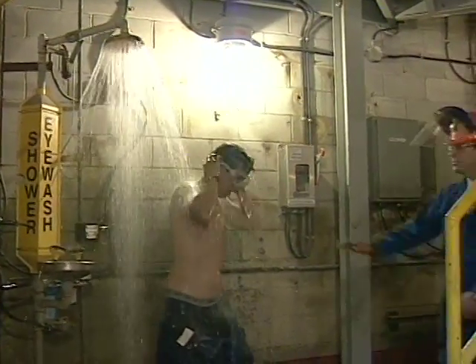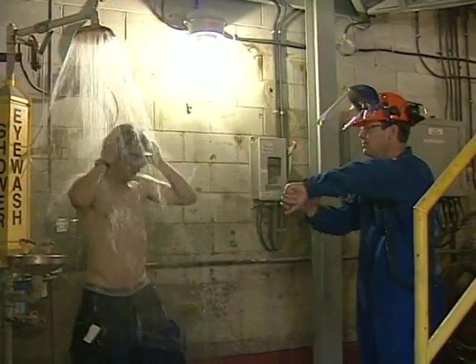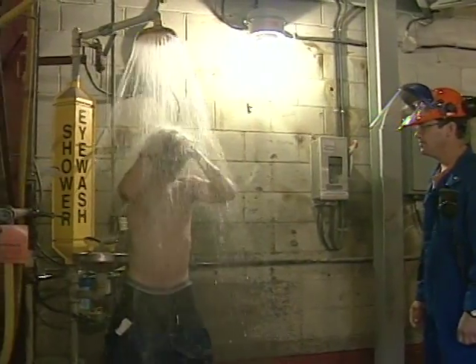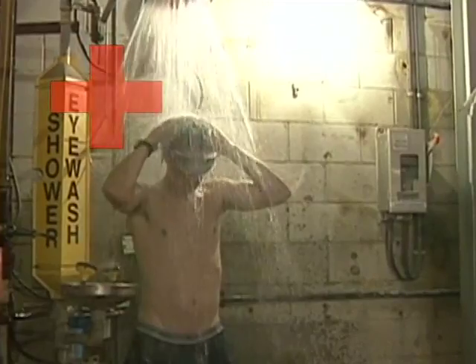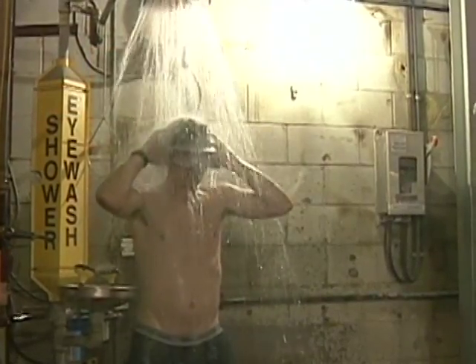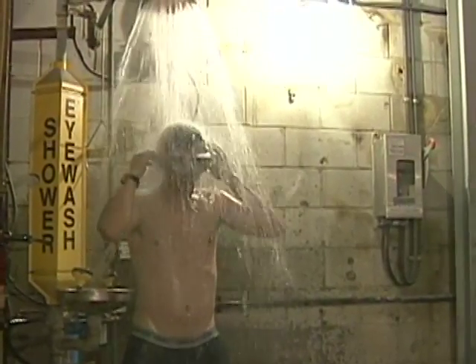Coworkers should make sure the person remains in the shower for the full time, and no matter how minor the splash, seek immediate medical help. This helps avoid secondary effects that could occur later, such as skin irritation, burns, infection.